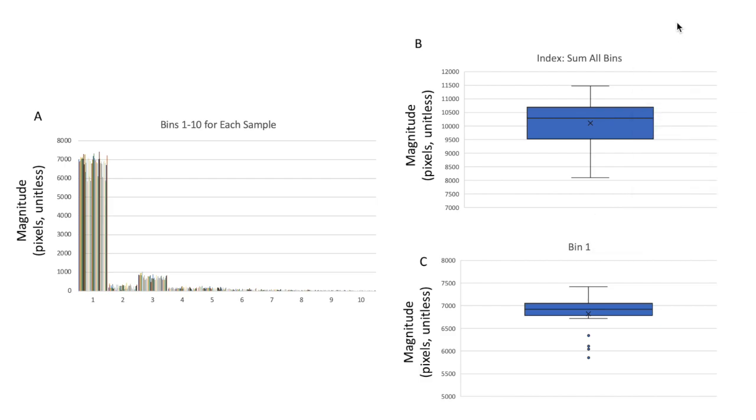So when you look at data of a population of objects, a simple and objective way to find subgroups would be to calculate quartiles. In this case, this is quartile 1, and then this bottom blue box is quartile 2, the upper blue box here is quartile 3, and up here is quartile 4. Right? And so these 4 quartiles are an objective way to define subgroups. But there's a more powerful way to do it that is called PCA, or Principal Component Analysis.